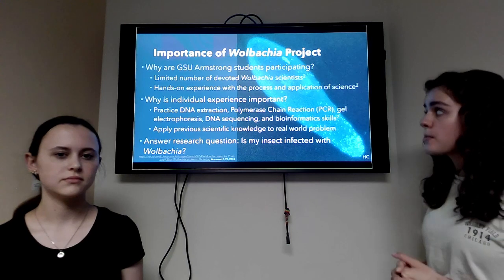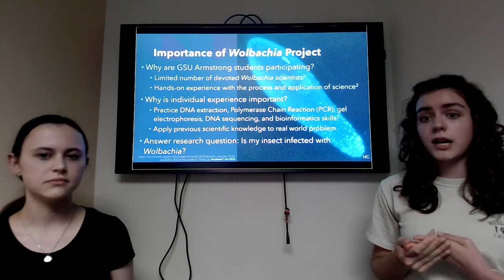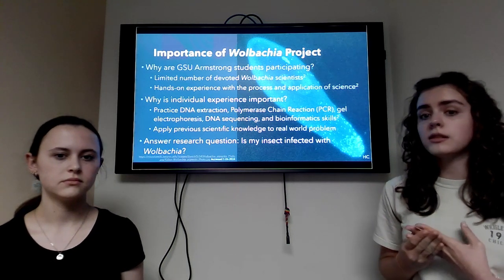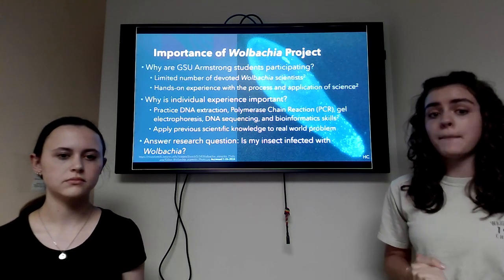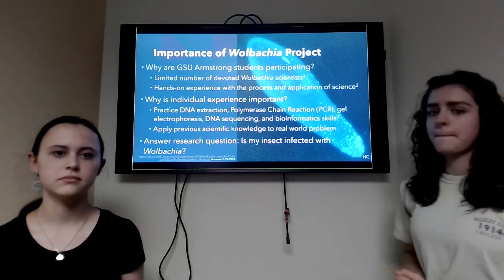And why is individual experience important? It's important to practice DNA extraction, polymerase chain reaction, gel electrophoresis, DNA sequencing, and bioinformatics skills. And most importantly, it's to answer the research question: is my insect infected with Wolbachia?